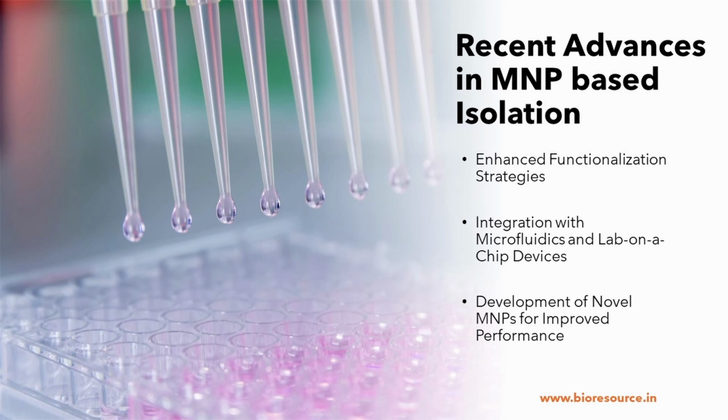So we can tweak these conditions for specific applications. As mentioned earlier, it is really useful for integrating with microfluidics and lab on chip devices. The MNP isolation is being integrated with microfluidic devices and lab on chip platforms. So for point of care applications, it is really useful. This workflow is really adaptable for integrated chip processing and also for utilizing in point of care applications.